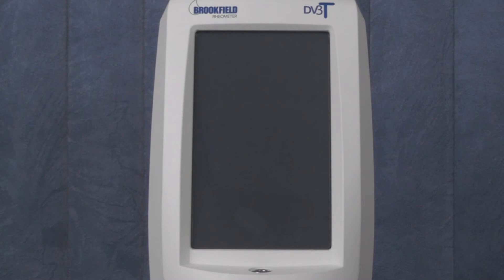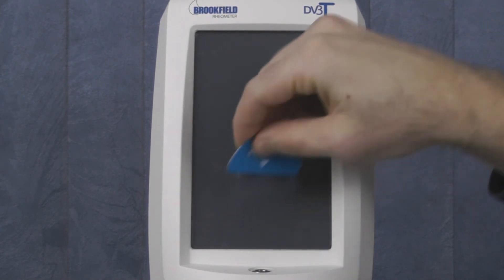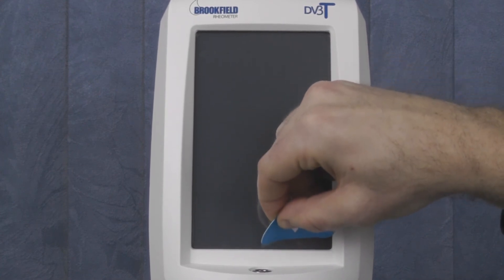Once the screen protector is applied, you will most likely have air bubbles trapped between the protector and the screen. Use the provided soft card to push trapped air bubbles from the center of the screen to the edge. Smaller bubbles should go away within 48 hours.